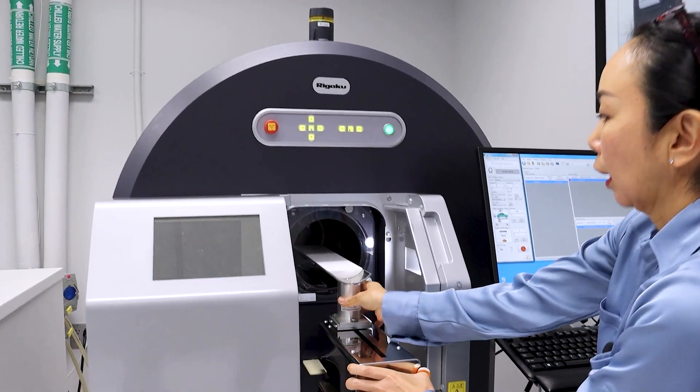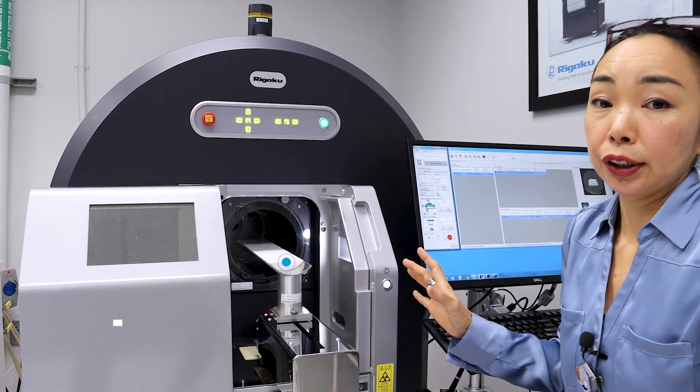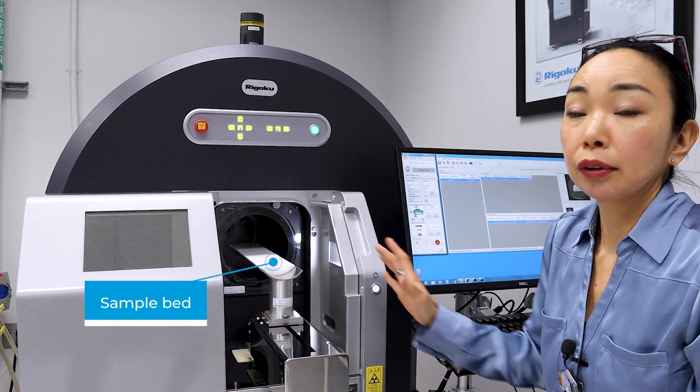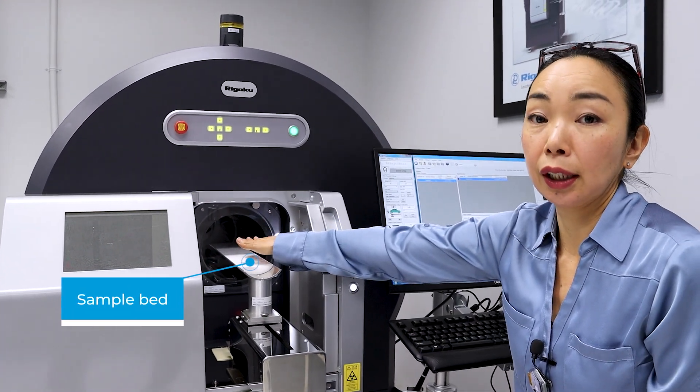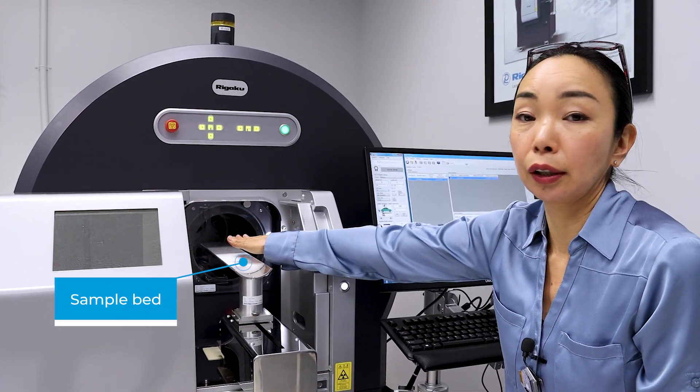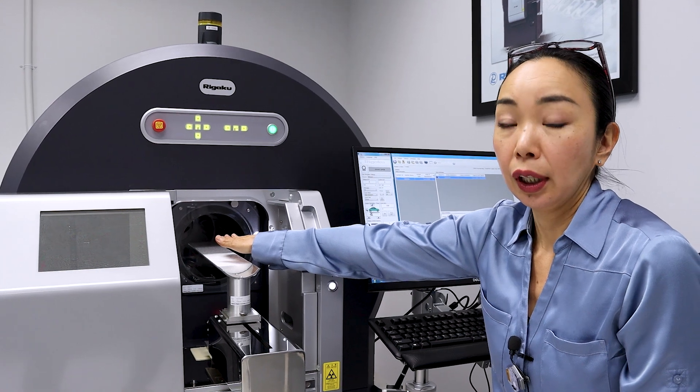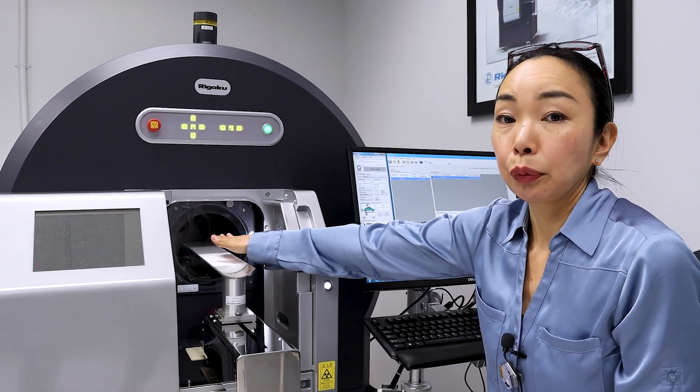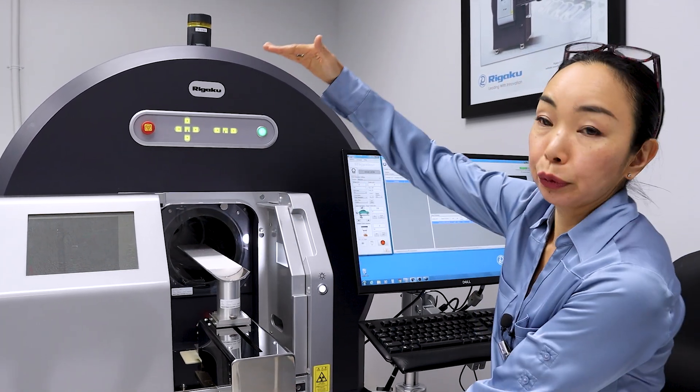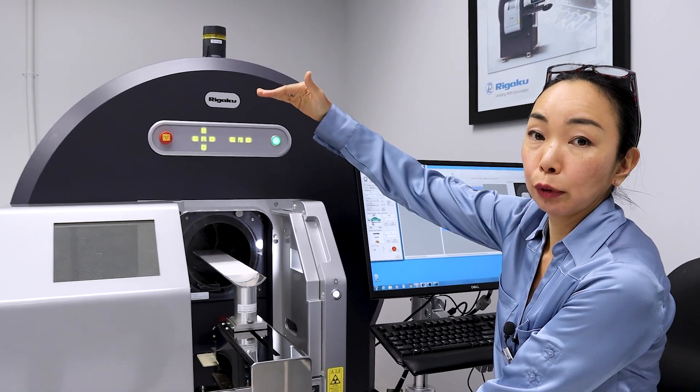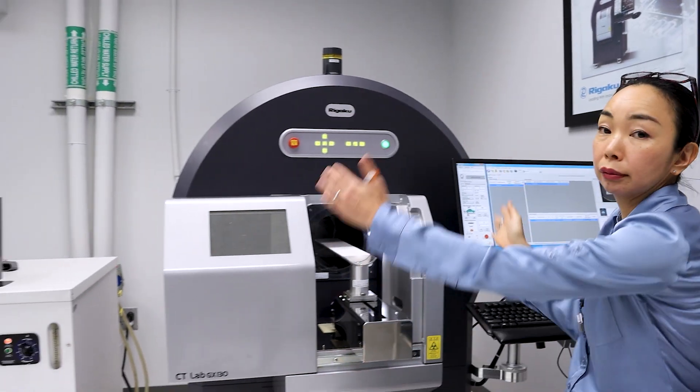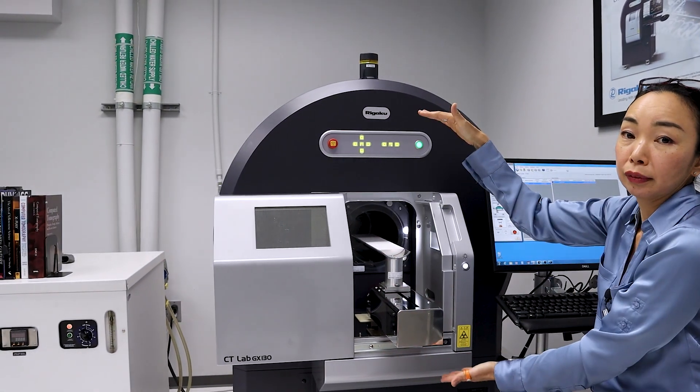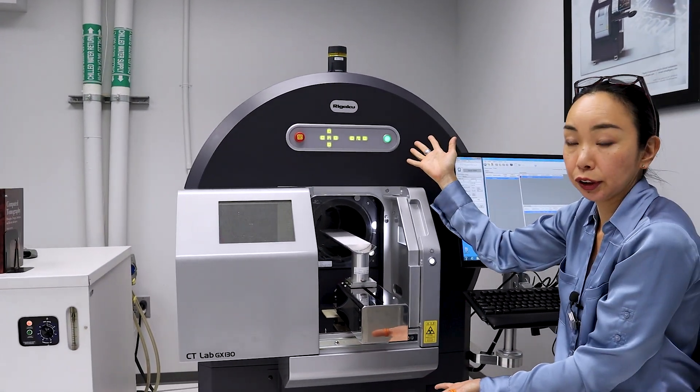With a gantry system, the sample goes on this bed and just stays there, and it's not going to rotate or move. Instead, we have the X-ray source and detector inside of this machine, and they go around the sample, and that's what we call a gantry system.